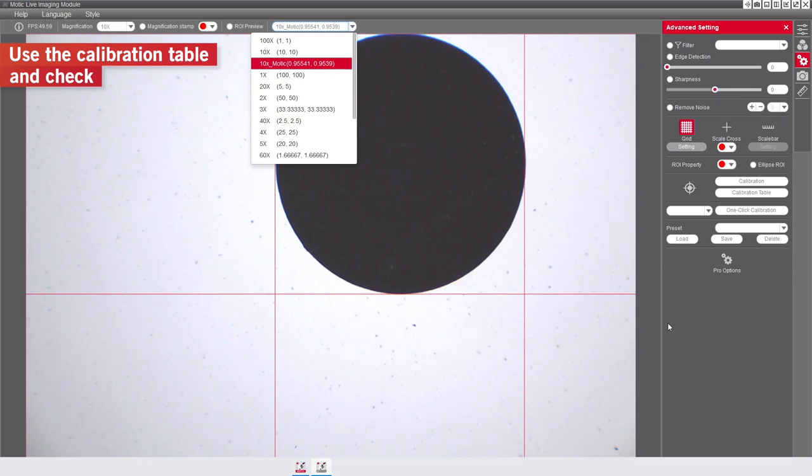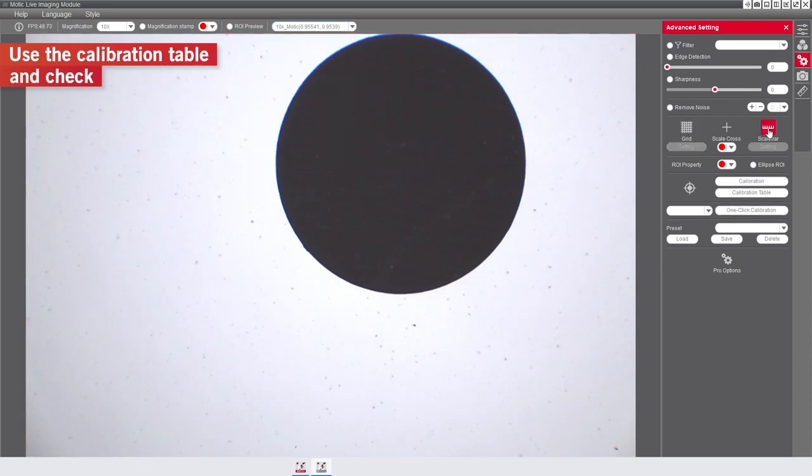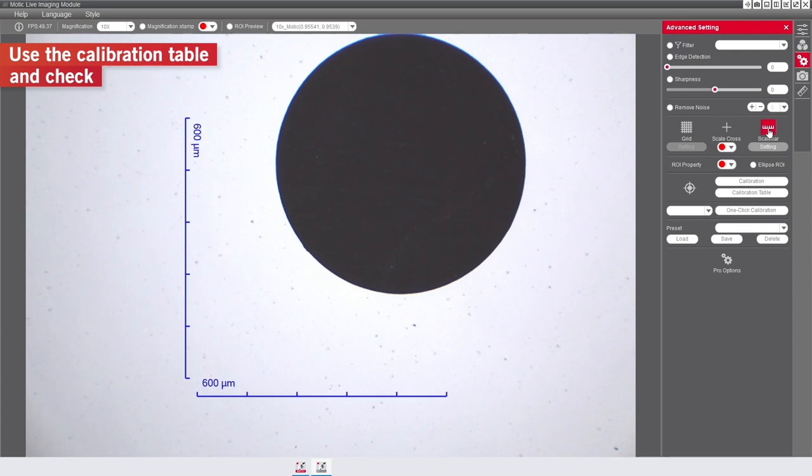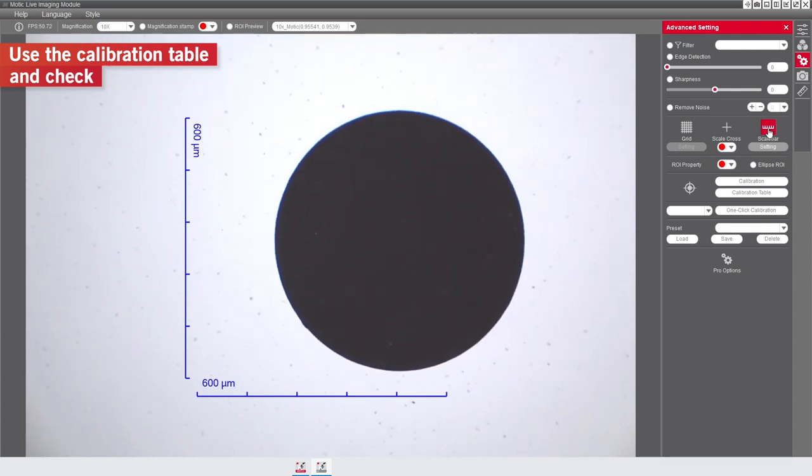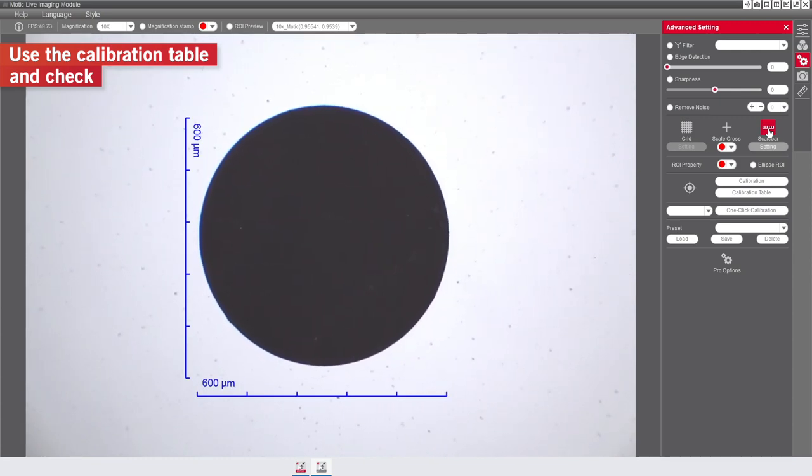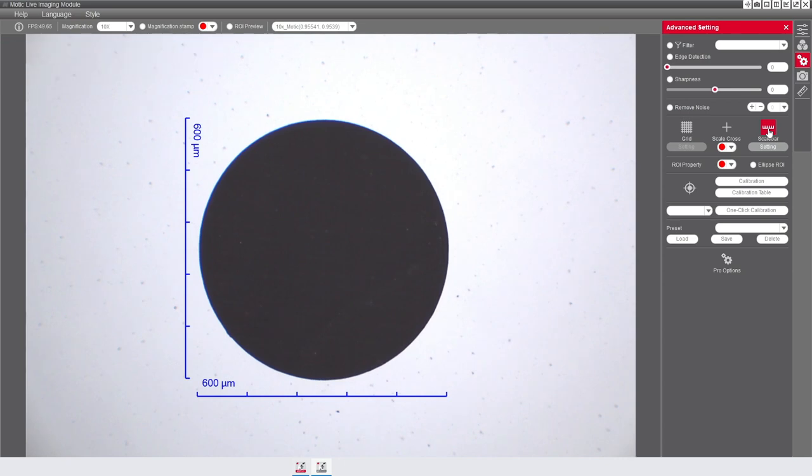Now, you will be able to get measures and insert scales or grids on live images you are working on. However, you can also manage these functions with images already saved. Let's go to see how to do it.